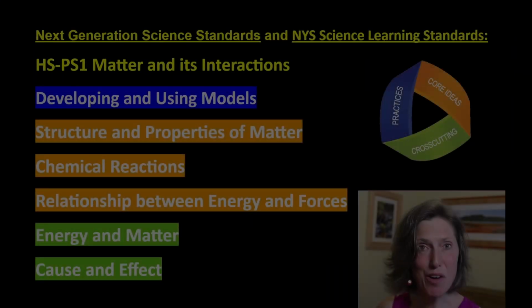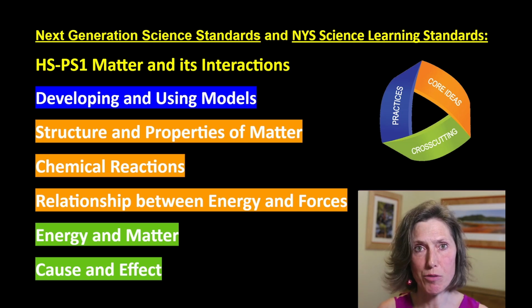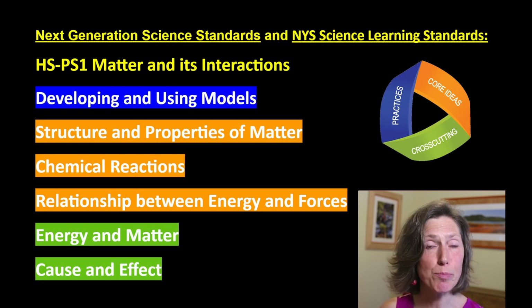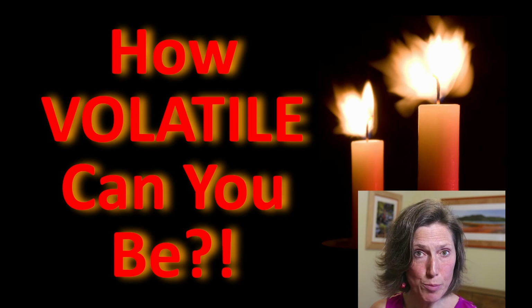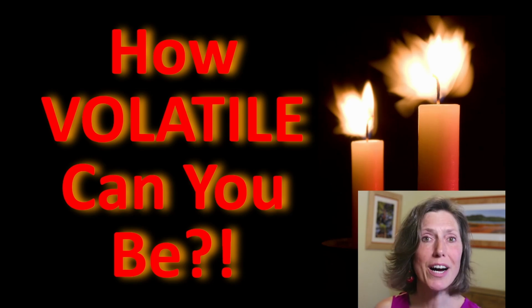So the power of this volatility lab is you really bring all the different bonds together and now focus on those intermolecular forces. We have covered here the Next Generation Science Standards and the New York Science Learning Standards, HS-PS1 on matter and its interactions. Obviously, intermolecular forces are very much related to volatility. They are very much related to bonding in general.